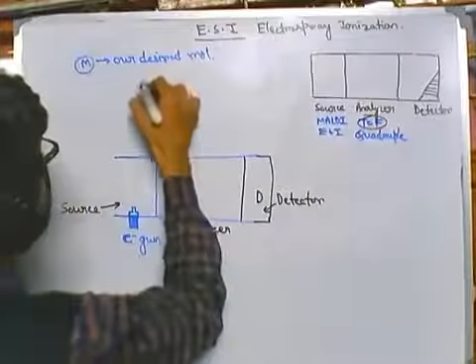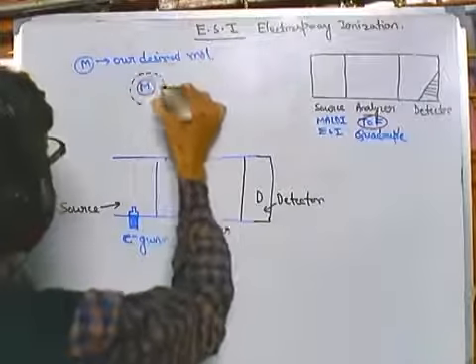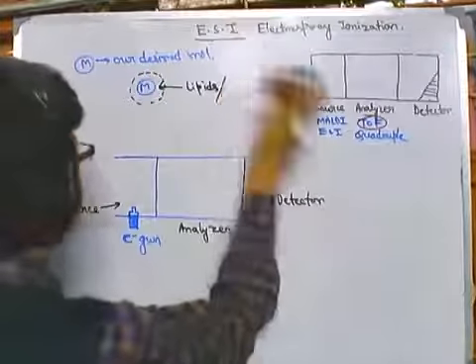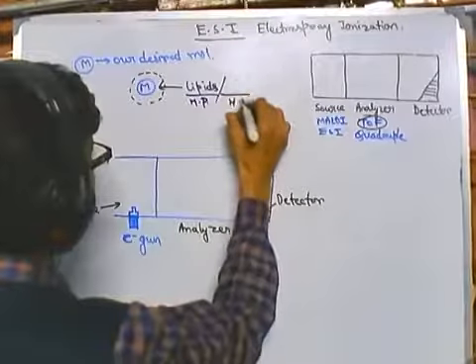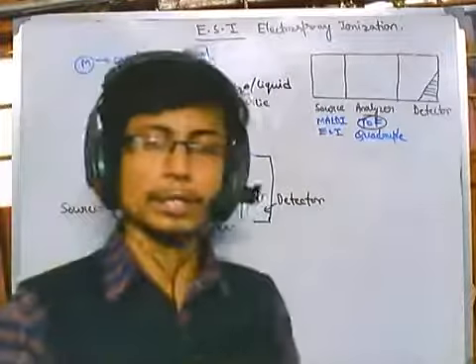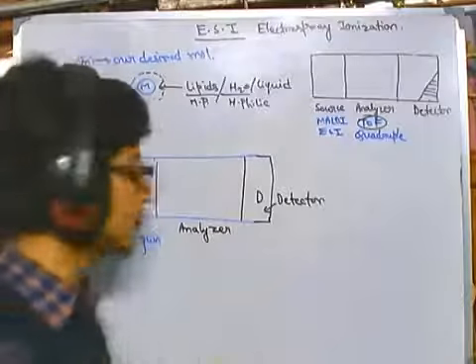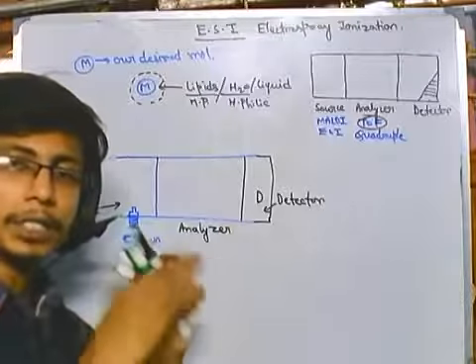How? Let's say this is the M, and surrounding this M we produce different layers. Now this layer is normally made up of lipids, or it can be made up of other types of layers, like a hydrophobic layer. It can also be made hydrophilic if I use water and other liquid sources. So with other liquid components, we are coating our molecule like that, right? Now after coating our molecule with our desired liquid substances, what we do is simply push it into the analyzer.